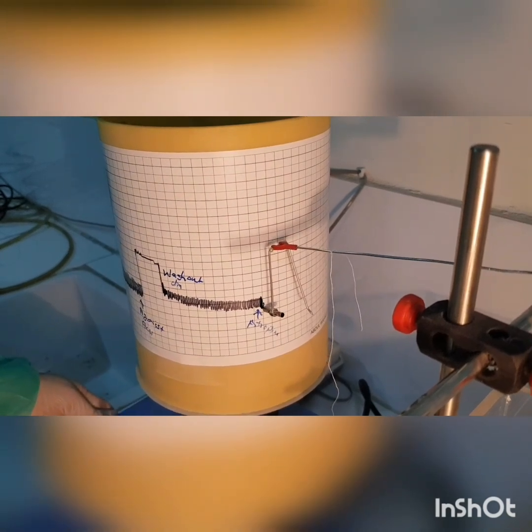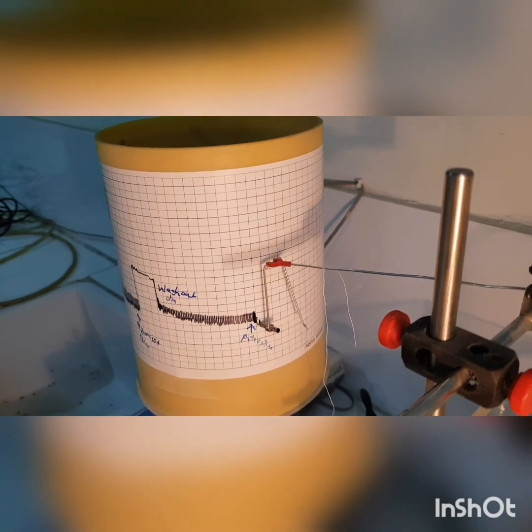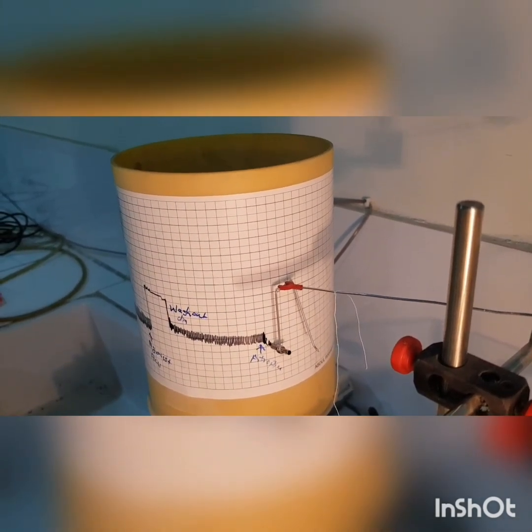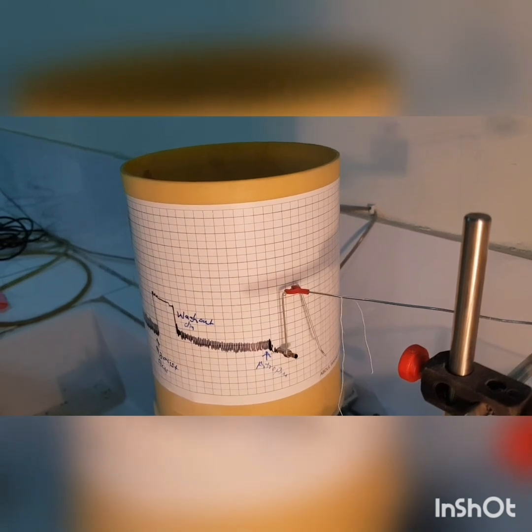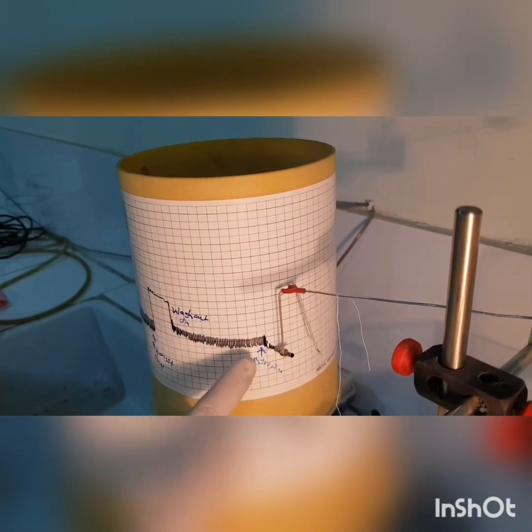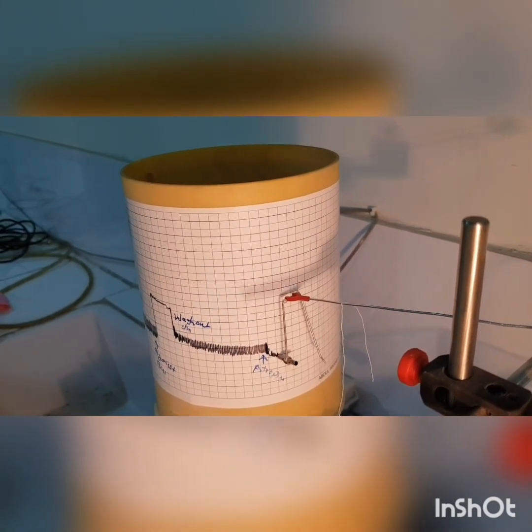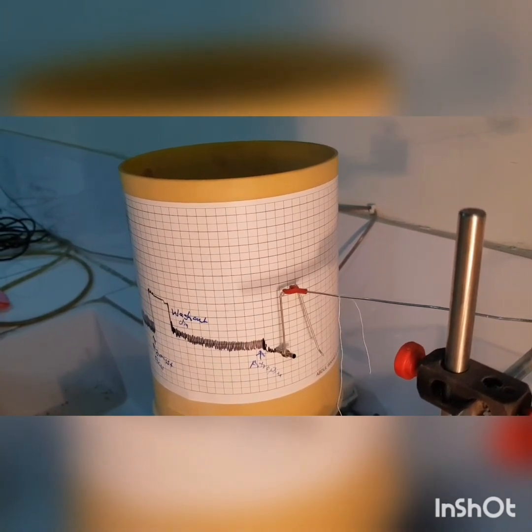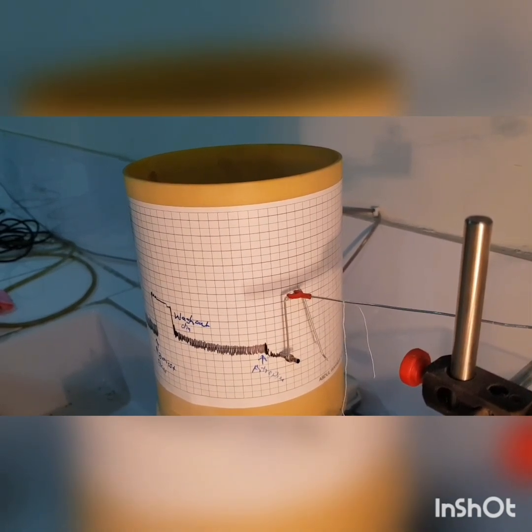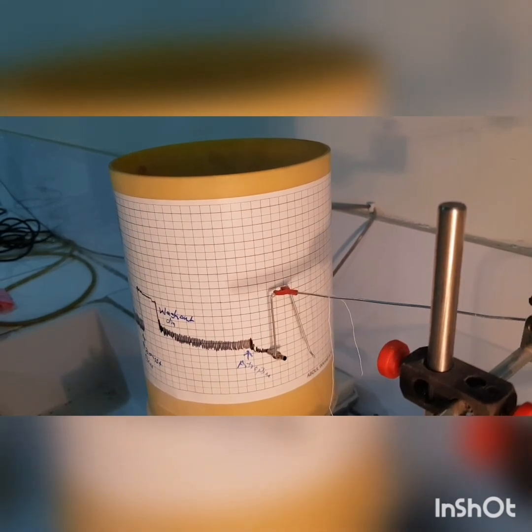This antagonist attaches to the muscarinic receptor, showing its effect. Atropine showing its effect. And the dose of atropine is 0.4 ml.